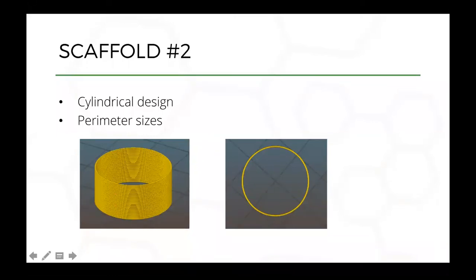Here, we'll talk a little bit more about how you could adjust the perimeter. In this case, because we'll just build a cylinder with no infill inside, it's a zero infill. Here you can again adjust the height and the distance, and in this example, we're still using the 14 gauge needle. We've already given each of you the file for Pluronic 14 gauge, so we'll just use the same one. But technically you could obviously use different needle sizes to get thinner perimeters.